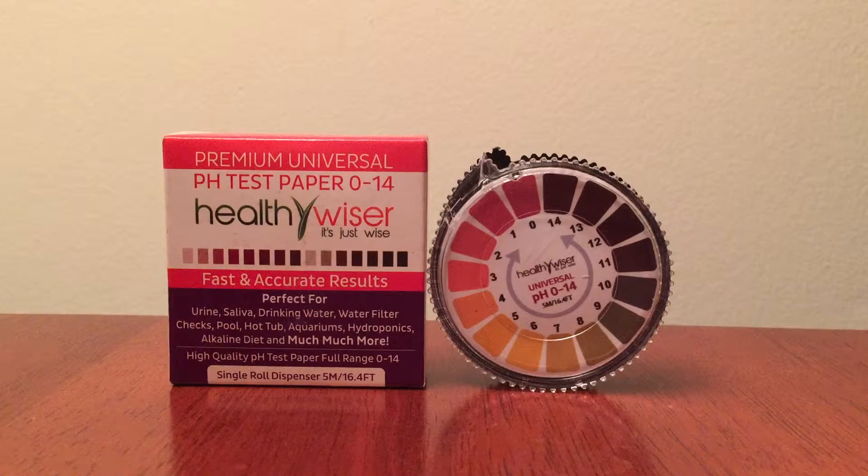Today I'm reviewing the HealthyWiser pH test strips. I never realized that they had so much variety of uses — I thought you could only use them to monitor your body's pH.